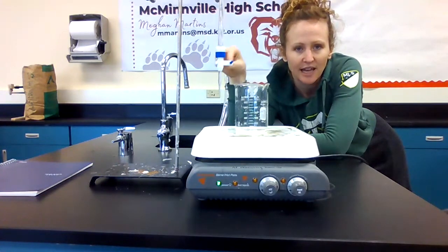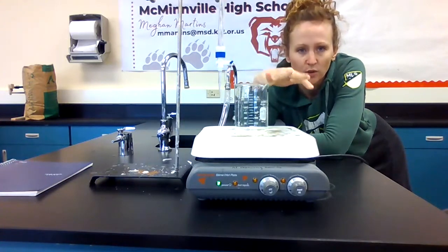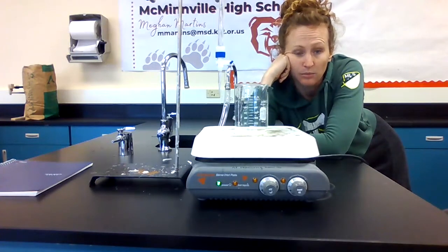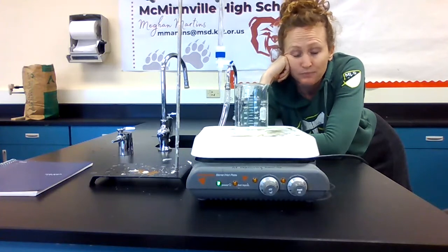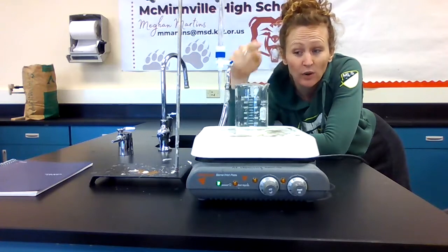If you don't stir it, you'll get a reaction on one side, and then as the molecules move through the solution, it will slowly hit its equilibrium point, its happy point of the reaction. But we don't want that to take a long time. We also don't want to sit here stirring by hand while adding something in from a burette. So a magnet takes care of all those problems for us.